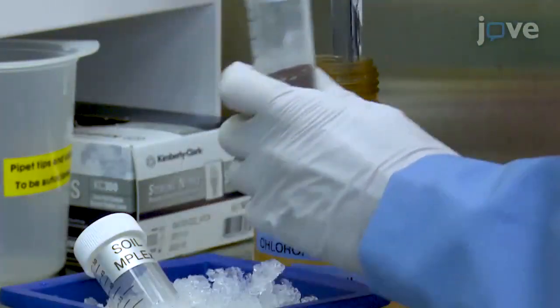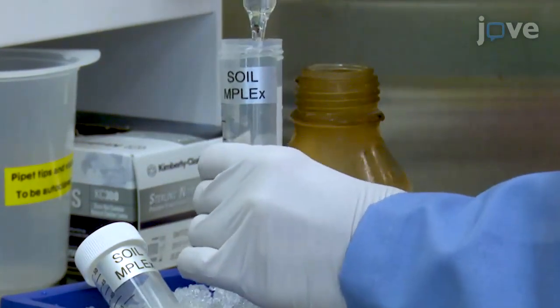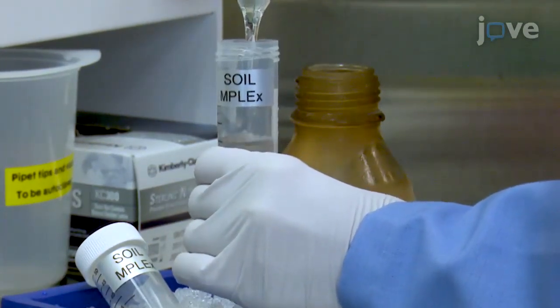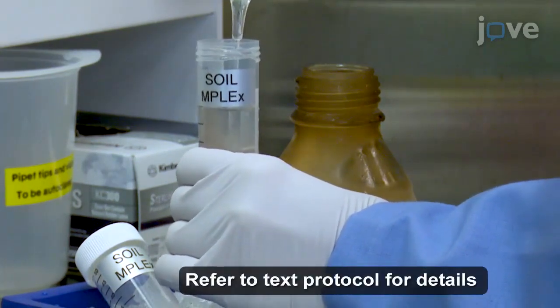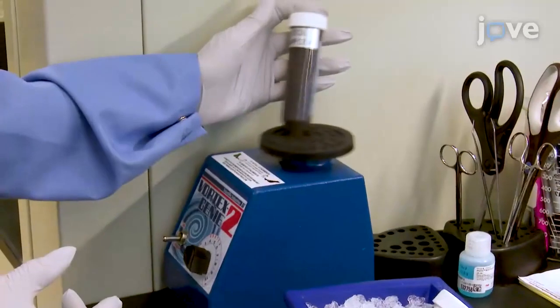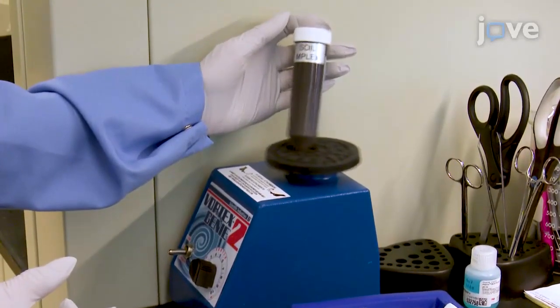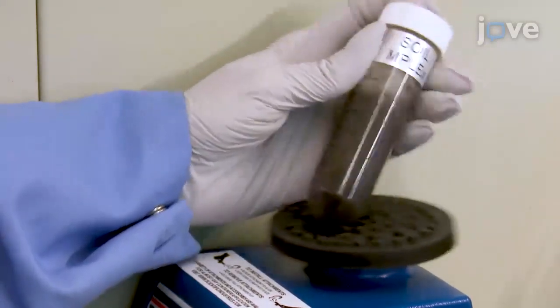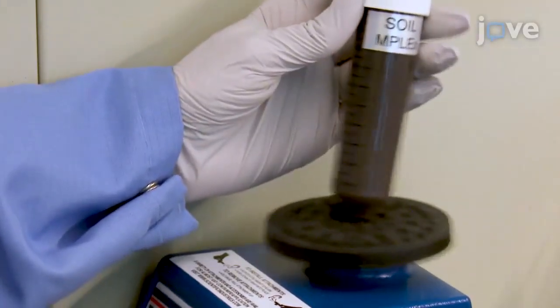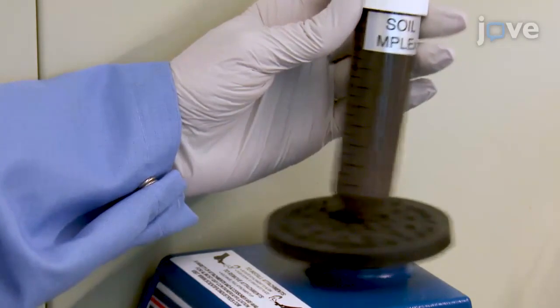Using a 25-milliliter glass serological pipette, quickly add 20 milliliters of ice-cold 2-to-1 chloroform-methanol (volume/volume) to the tubes. Tighten the lids and vortex the soil mixture into solution. The chloroform-methanol helps break down the cell wall of prokaryotes and also inactivates enzymatic activities.